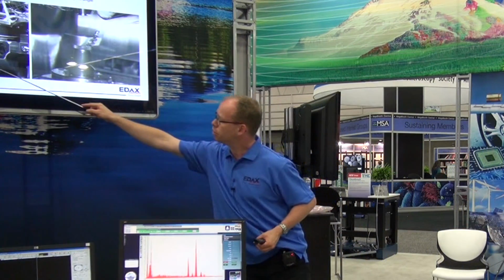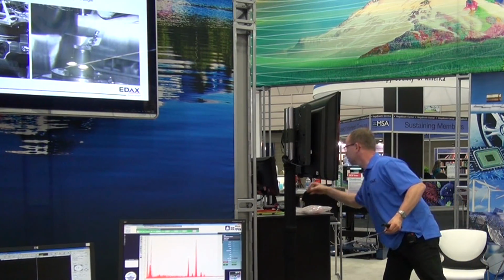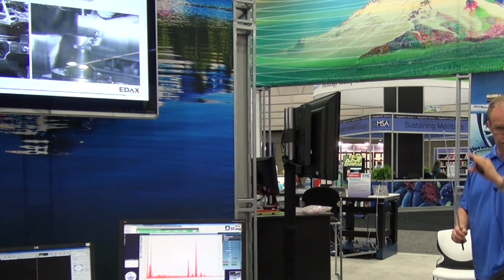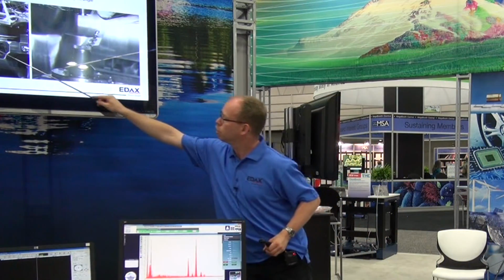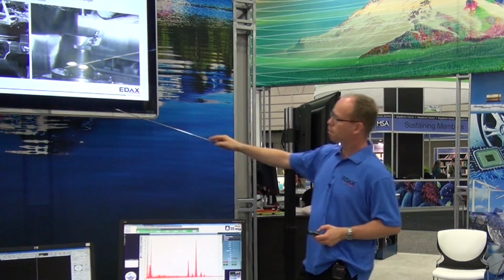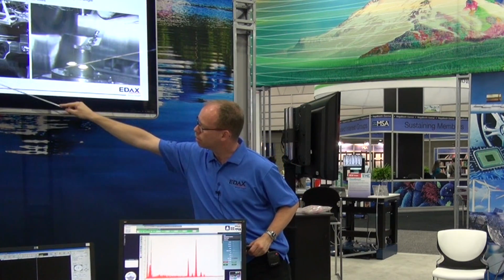Then there's this one. This is a new holder. It's a very small one. It is this holder here. So you can, if you like, just pass it on, so you can take a quick look at what that is. It's also a little holder, a little clip. You mount your sample on the top, and there's a little inset, and a little groove where you mount your foil, and then there's this copper thing with two fingers to hold it in place.